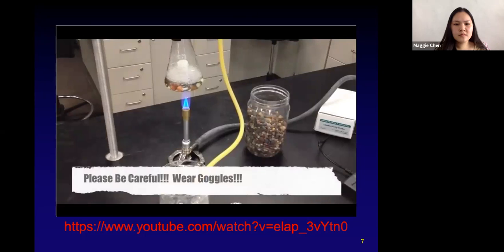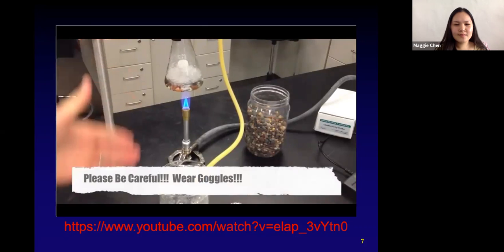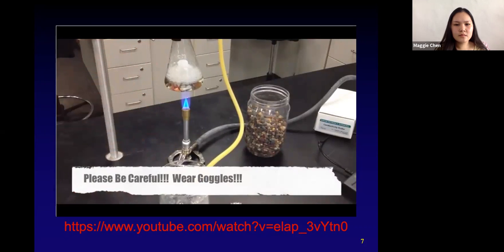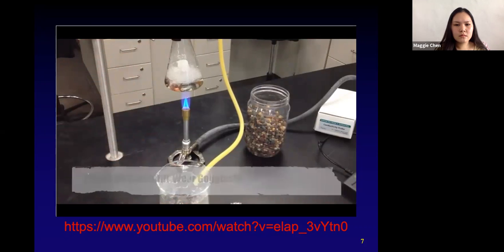Again, just be very careful. This is a potentially dangerous situation, so please don't sit on your iPad and play games. Obviously, you'd never want to do that, but this is something you need to keep an eye on. We've got very hot steam, boiling water, and a potential pressure situation if this gets backed up, so make sure you're monitoring this the entire time it's happening.